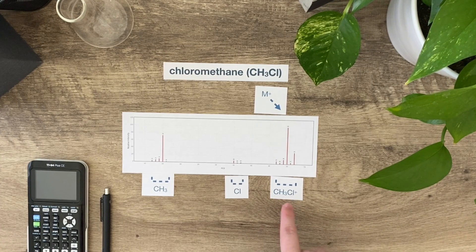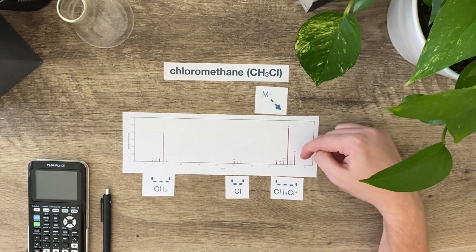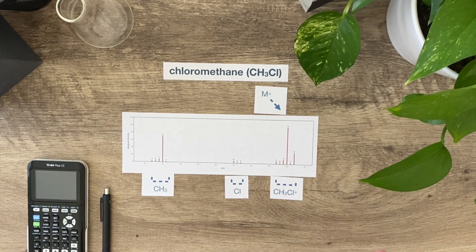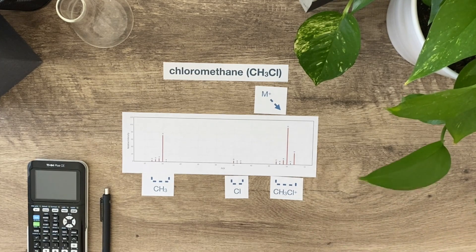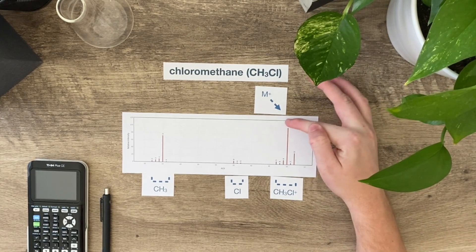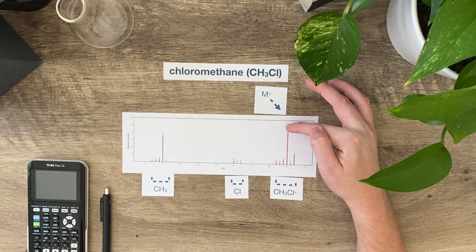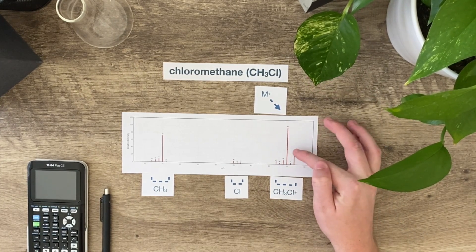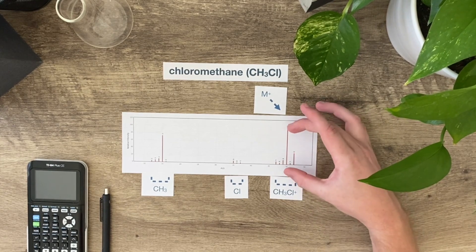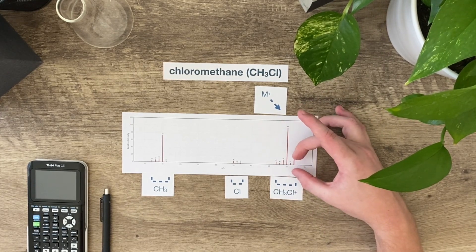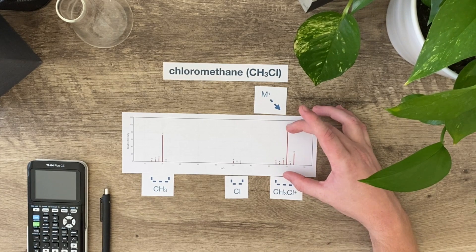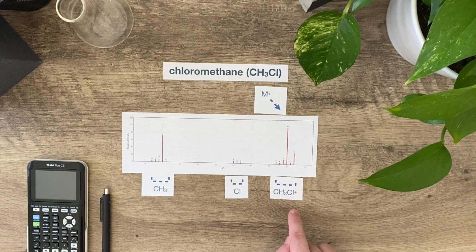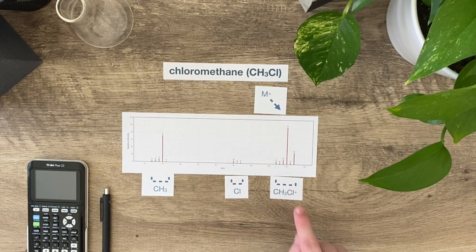This also tells us something else very key. If there's a chlorine present, there will always be this relationship here, because chlorine always has those two isotopes, 35 and 37. I'm going to have a big peak here of 50, that's when I have Cl-35. When I have Cl-37, it's going to be right down here at 52. So this relationship of a peak here and a peak that's about one-third of the M+ peak associates that there's a chlorine present. Anytime I see that, that means chlorine is present.